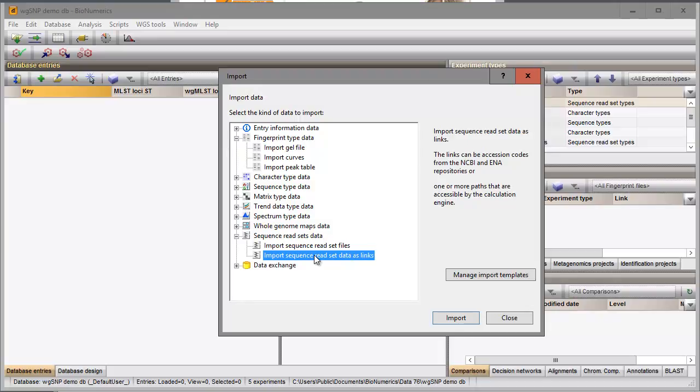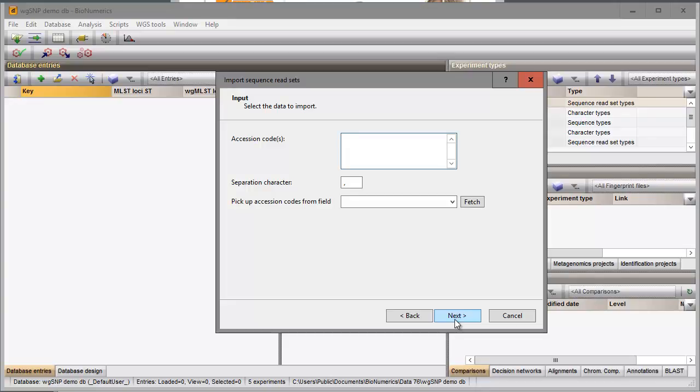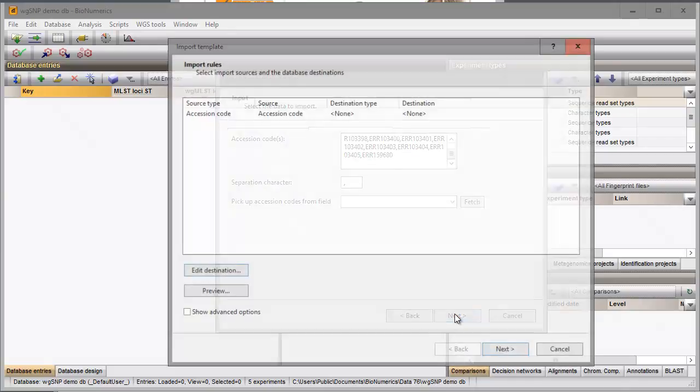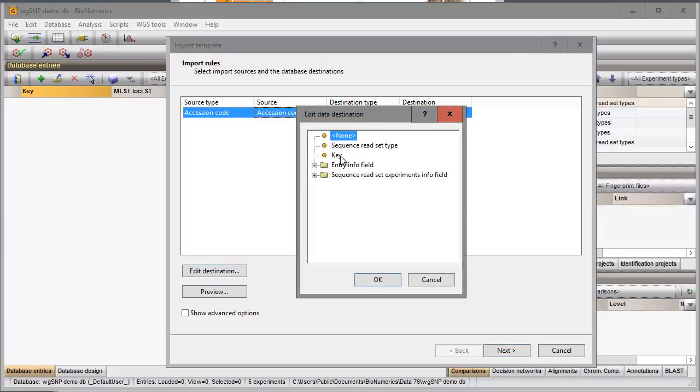I select the Import Routine and in the next step I need to specify the data source. I select NCBI in this example and I provide the accession codes in the next step. Here I will specify that the accession codes should be used as key in the database. I double-click on the only row in the grid and select key as data destination.